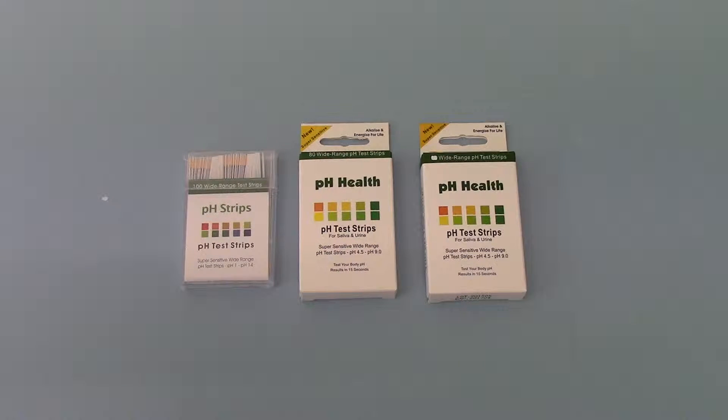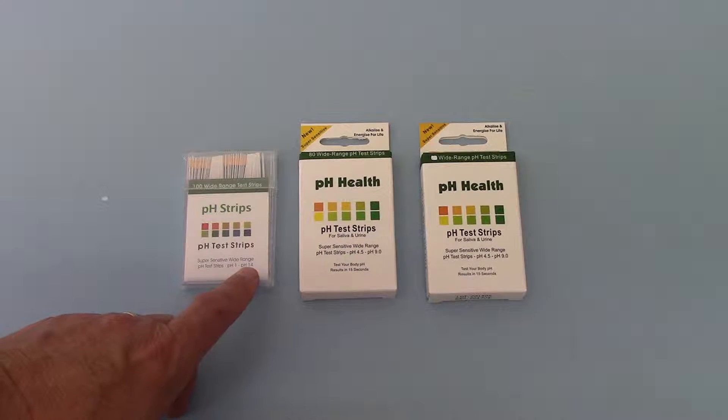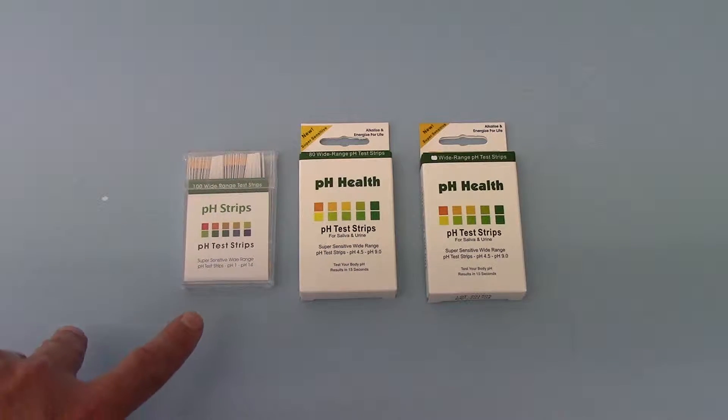These come in a range of different brands and different ranges of pH. The first thing you need to look at is the range or width of pHs that the test strips are able to detect. On the left here is a wide range of pH test strips, which will test from a pH of 1 right the way up to a pH of 14. This gives you a wider range of pH detection, but most of those ranges are actually outside what normal physiological human body fluids are going to be at.